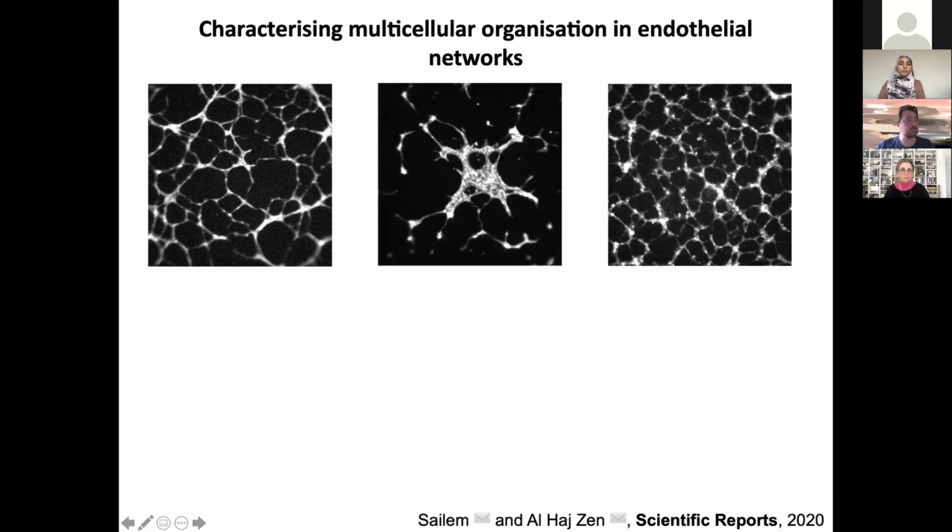So here, for example, we see the effect of different drug treatments, and you see that even the tubes have different properties. What biologists usually do is measure the total length of the tube, just segmenting the tubes and measuring that, which doesn't give us a lot of information about all the aspects of the network that can also provide finer details on drug effects or genetic perturbation effects.